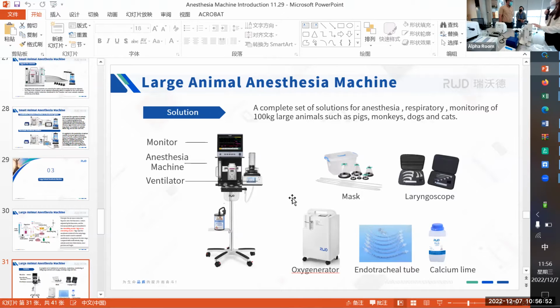So for virus study, for example, we want to study a virus like influenza because it's airborne. Can we have the purified influenza in the air, for example, in a can? Yeah. Then can we connect it to the air pump and deliver it to the chamber to infect the animal with the influenza virus?